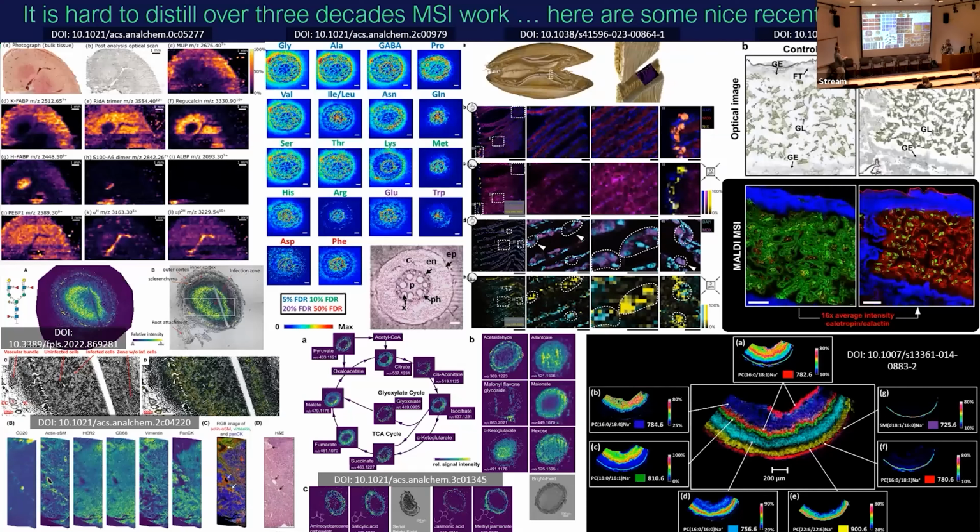There's been a lot of development within metabolic profiling as well. As one of our panelists has shown, a lot of work has been put into on-tissue chemical derivatization for metabolomics, doing targeted experiments, whether we're looking at amino acid metabolism, and having some fundamental frameworks that are really accessible, like Metaspace, which is an online portal for data interpretation. And then we can do the same metabolic profiling and see all of these very interesting metabolites and how they interact between different spatial localizations and within the fundamental biomechanisms.